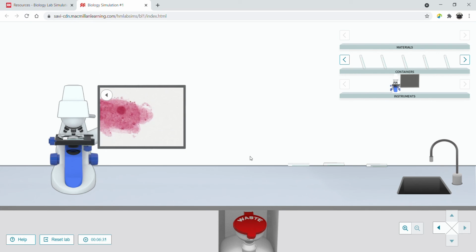Okay, there it is. Here's your amoeba, and you see this big dark stained circular entity is the nucleus, and here's your cell membrane, and here is your cytoplasm in here, and you kind of see pseudopods. Pseudopod, pseudo means fake, pod means foot. So they're not feet, but they kind of look like feet, because that's how that little bugger gets around. It just extends its pseudopods.